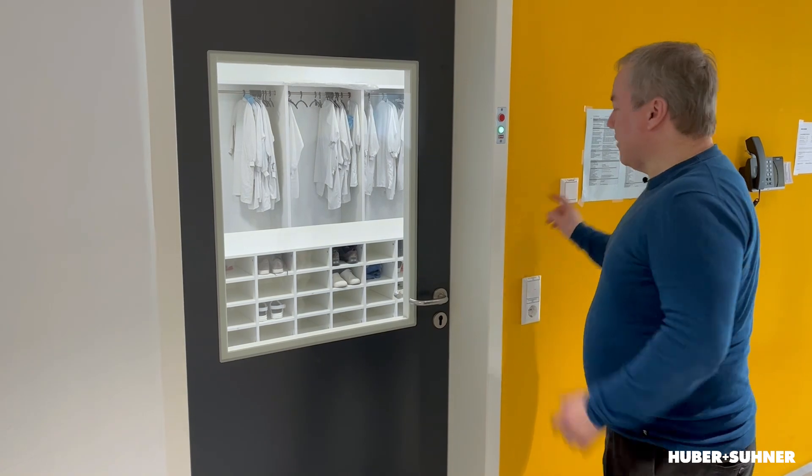They are magnetically locked. So if I want to enter, I have to push this button and then I can go through.